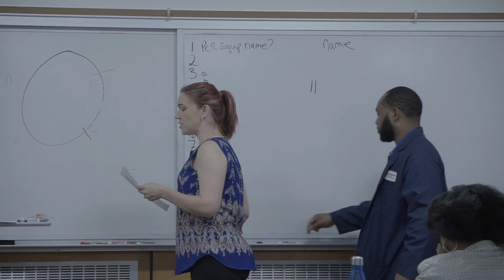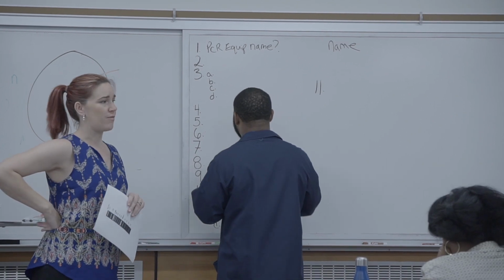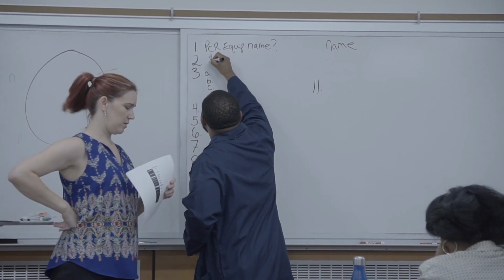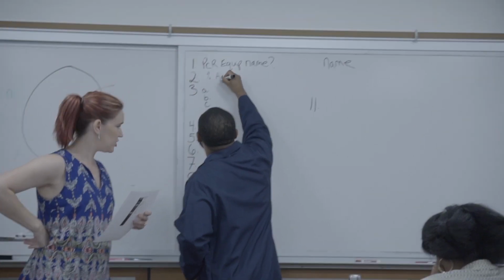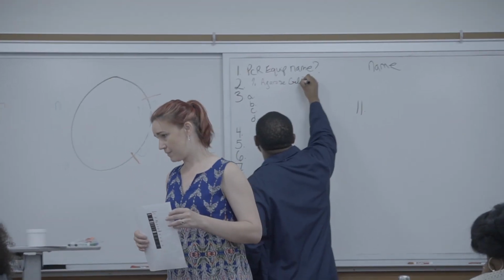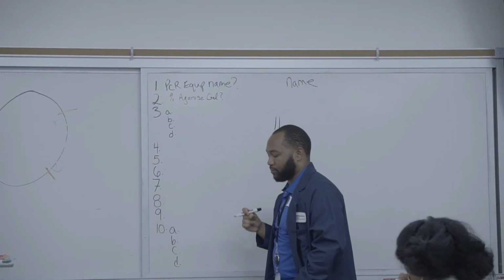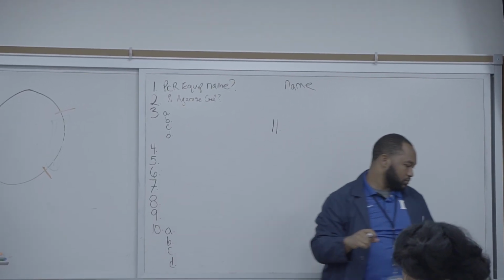All right, number 2. What was the percentage of the agarose gel that we ran today? Or made and then ran our samples on? What percentage of gel did we run? Just keep it to yourself, and this just helps us assess how we're communicating.